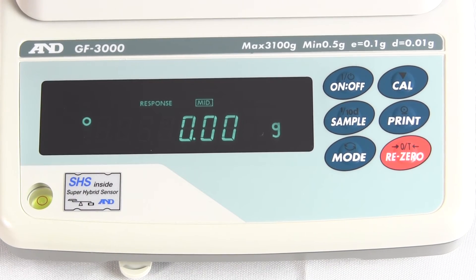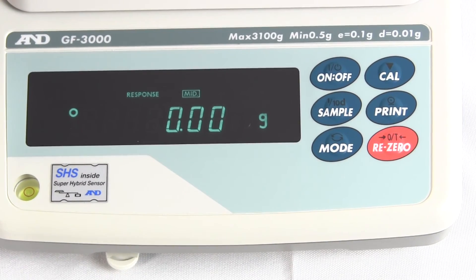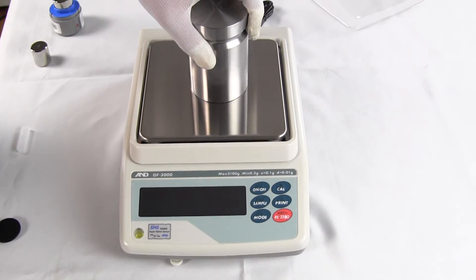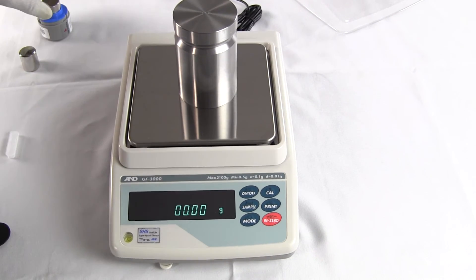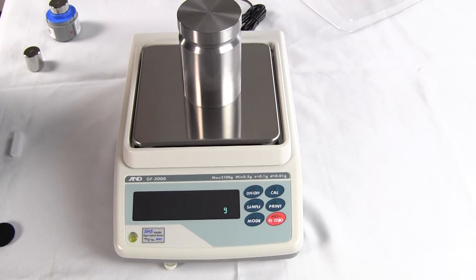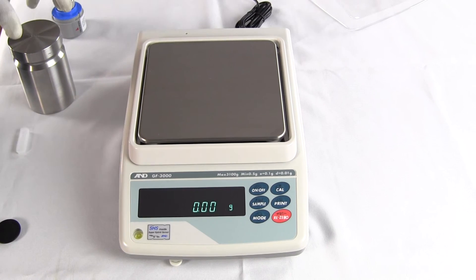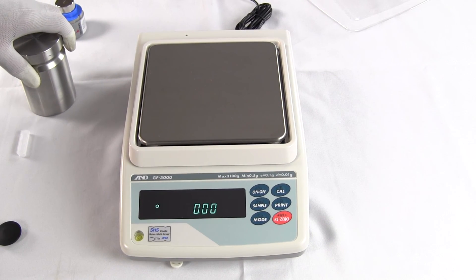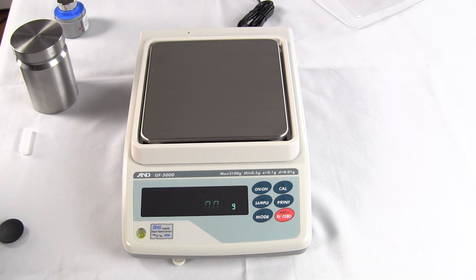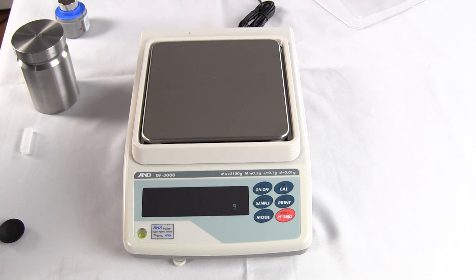A little more about A&D: this balance has a five-year limited manufacturer's warranty. Many balance manufacturers have cut back their warranties substantially — some now offer only one year, others changed from three years to two. If the balance is so good, why not have a strong warranty? We're Precision Weighing Balances — you can visit us at balances.com or scaleman.com, and we're an authorized A&D dealer. Give us a call if you have any technical questions. This is the GF-3000; they have models from 1,200 grams up to 6,100 grams by a hundredth of a gram. A&D is a great affordable product.